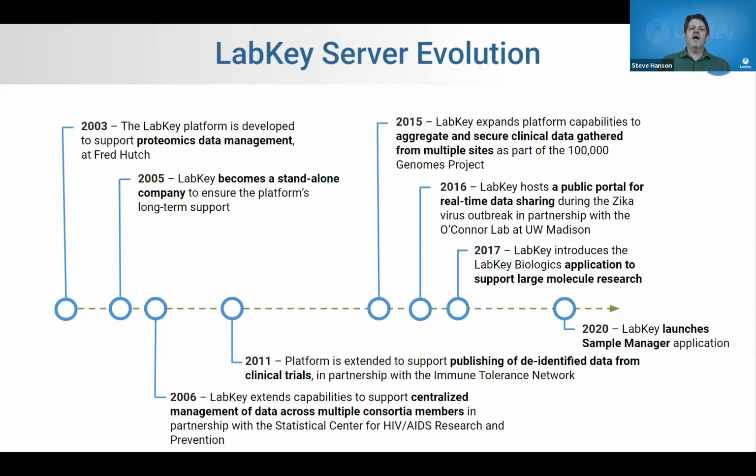Really, hundreds of scientists have come to us over the years, each with their own set of problems. We've responded by building out solutions for them. We've tried to make those solutions as general as possible so that they don't just apply to that one scientist, they apply to the domain as a whole. And so a lot of features have built up over the years. Basically, what has happened is LabKey Server has turned into an enormous toolkit for scientists.